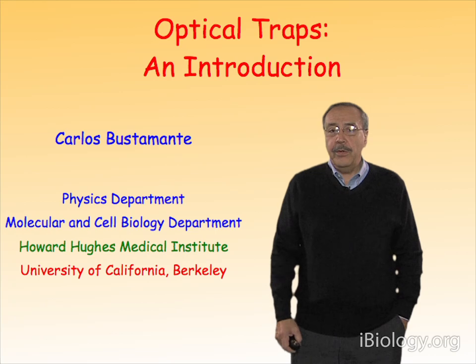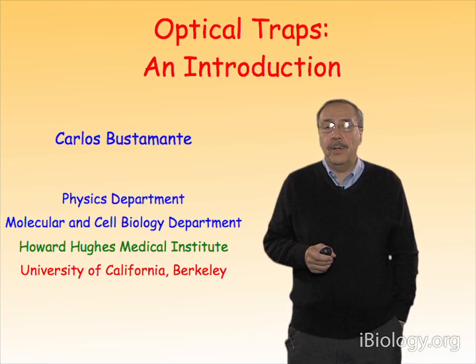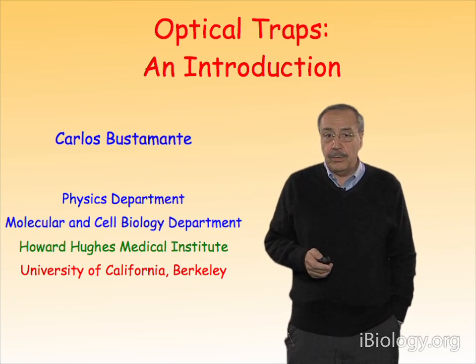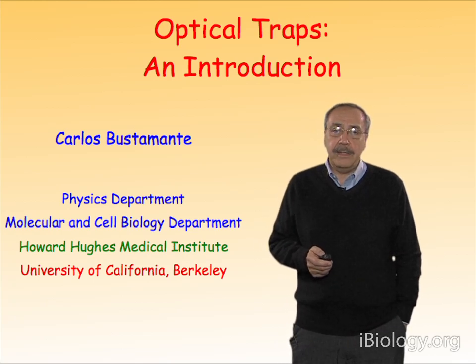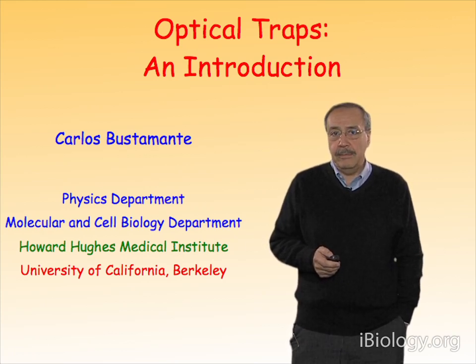Okay, so today we are going to have a lecture on the design, principles, and applications of optical tweezers. My name is Carlos Bustamante, and I would like to tell you about how optical tweezers work, and what are the principles on which they are based, and what kind of applications you are able to use optical tweezers on.